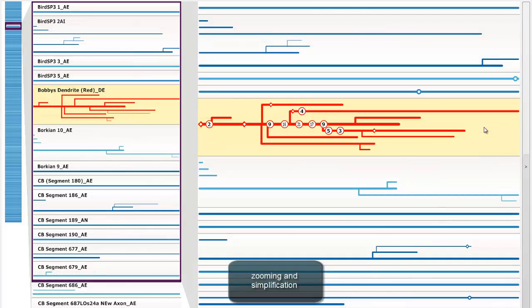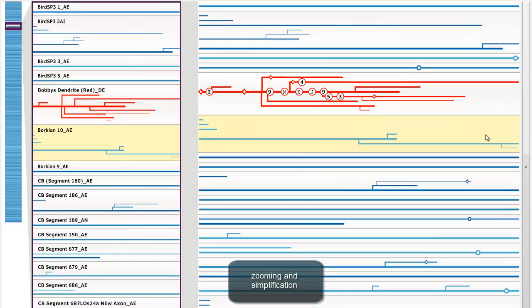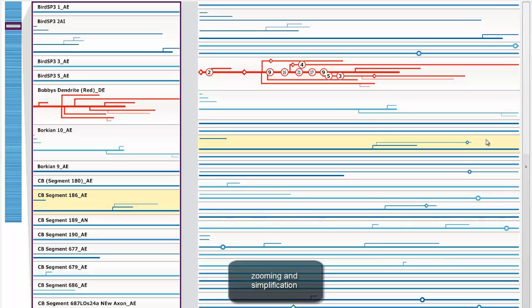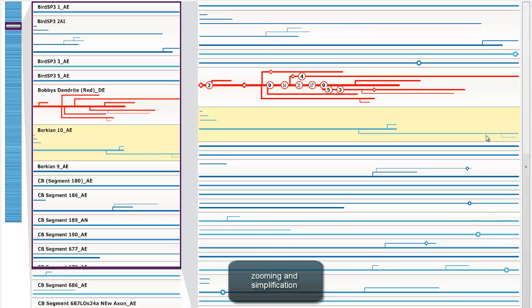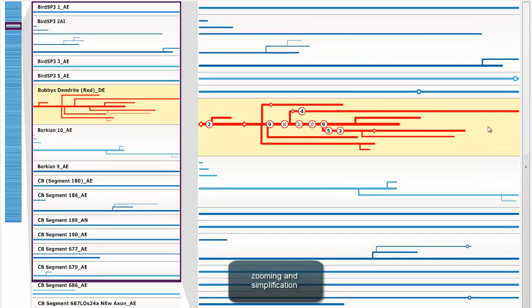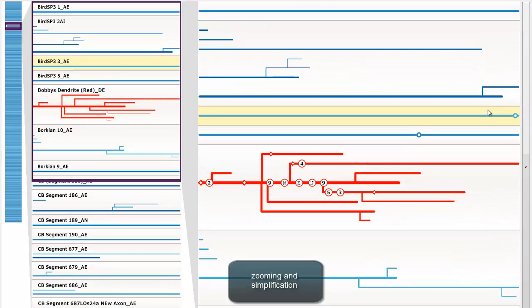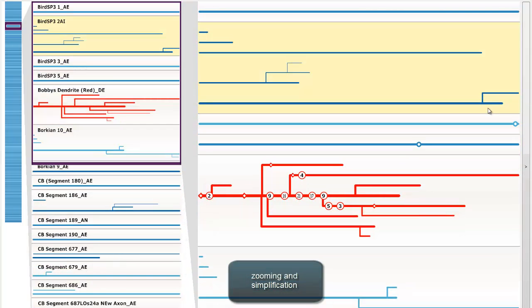The view can be zoomed and panned both vertically and horizontally. When zooming out, the neurite tree visualization is gradually simplified. When zooming in, gradually more details are shown.